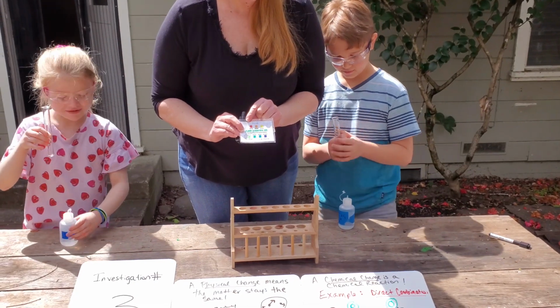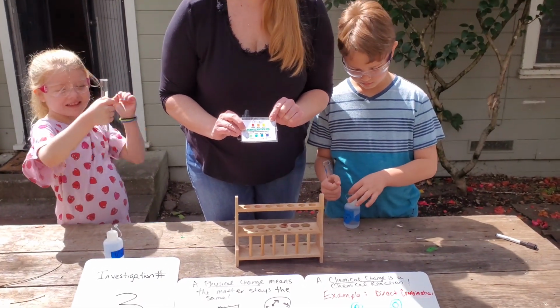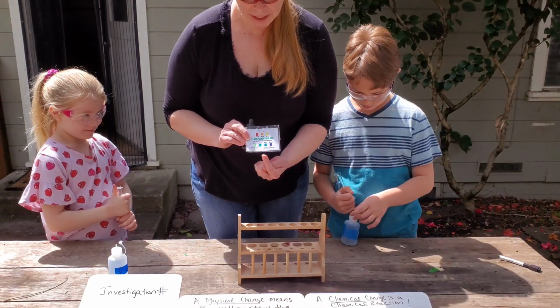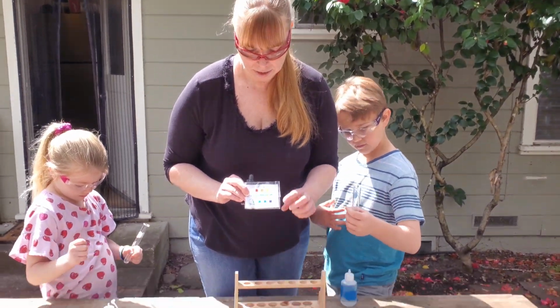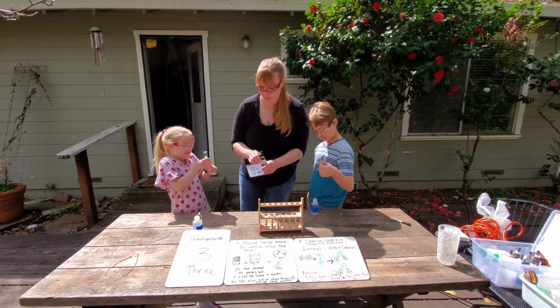Acid will be a pH below 7, and it will be a red, orange, or yellow color. If we have it neutral, like water, it'll have a pH of 7, it'll be green. If we have a base, it will be like turquoise to bluish to purplish color. That's a base, all right? And so right now, we're going to test both of these and see which one's what.